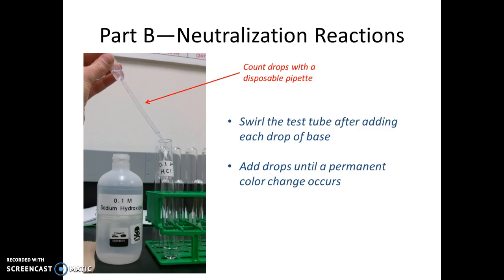Keep adding drops of sodium hydroxide until you see a permanent color change — when the solution turns pink, that indicates the end of the neutralization reaction. As you approach the endpoint, the solution may briefly turn pink but return to colorless after swirling; a permanent change means it stays pink even after mixing. Repeat this for all four neutralization reactions, recording the number of drops of sodium hydroxide added in your data table for Part B. When finished, pour the solutions down the drain, wash your test tubes, and you're done with the experiment.